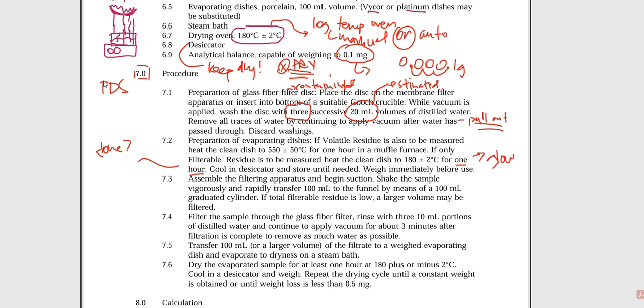Because you need to make sure that you wear gloves, and the reason is because you are dirty, filthy, trashy animals. That's right. All your fingers are greasy, your fingers are dirty, you probably had lunch, or you've been snacking, or you've been eating, or you've been digging, or you've been rubbing. Who knows what you've been digging and rubbing, but your fingers are quite filthy. Even if you wash them, they're going to be quite filthy. And I don't want your finger grease all over the dishes, because all of that contamination that comes from you is going to be transferred to the dish, and that's going to be extra weight, and that will give us an invalid result, because it is not just residue now, it's residue plus all of your dirty and filthy nastiness.